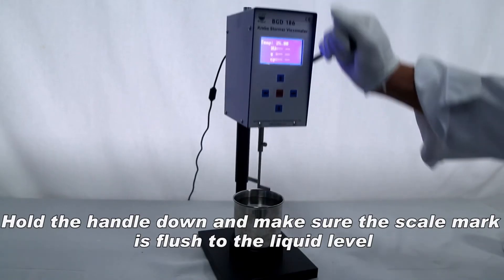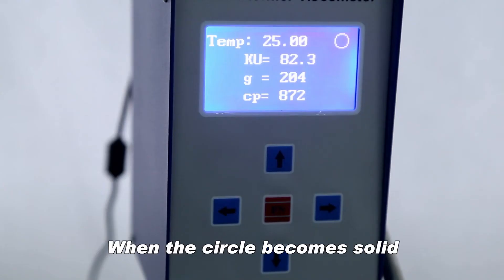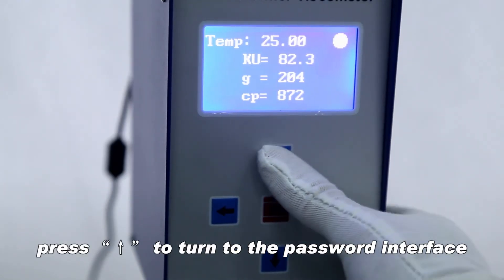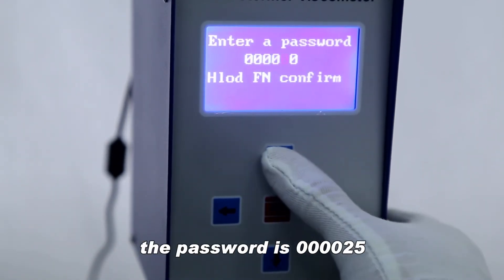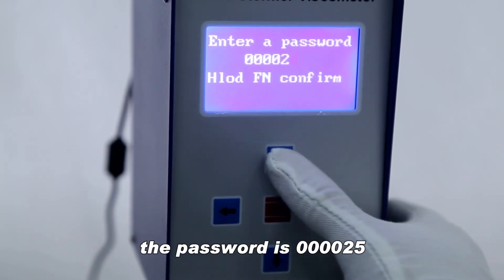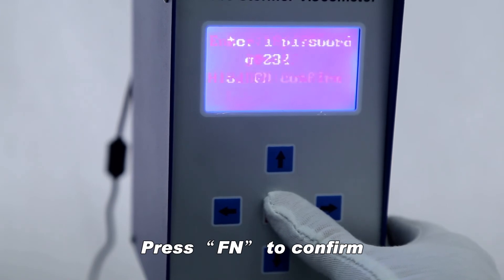Hold the handle down and make sure the scale mark is flush to the liquid level. When the circle becomes solid, press to turn to the password interface. Press to move the cursor and press to modify the number. The password is 000025. Press FN to confirm.